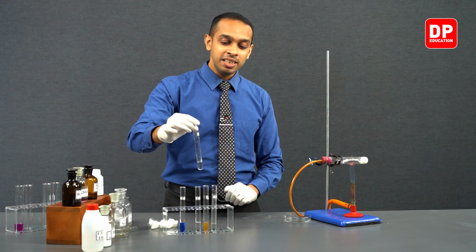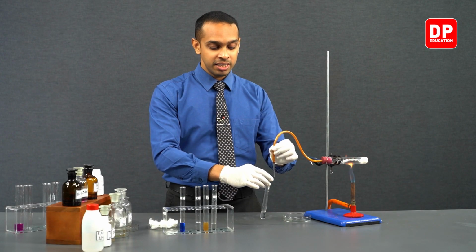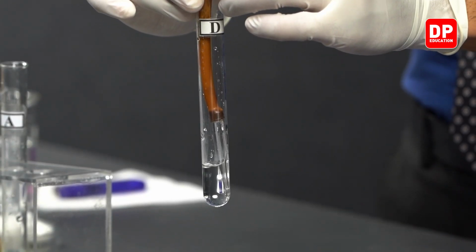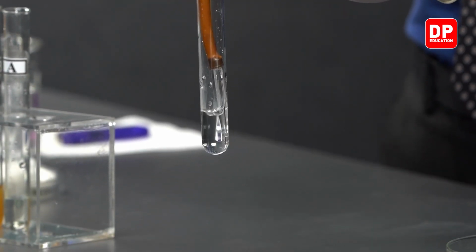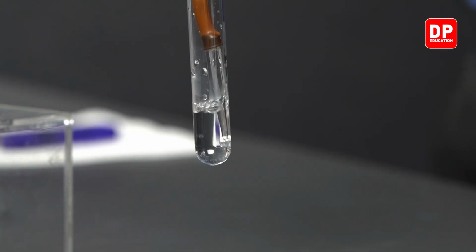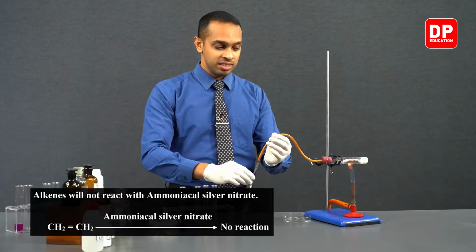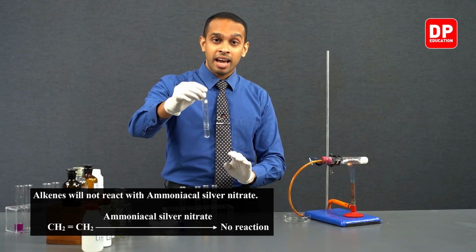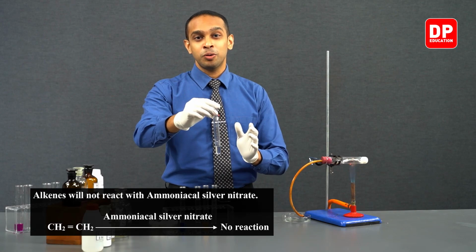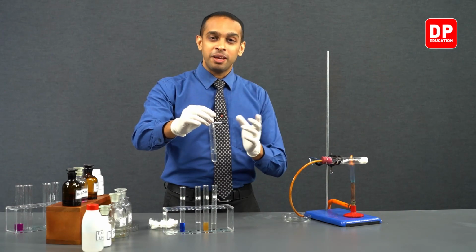In test tube D, we have ammoniacal silver nitrate. Now we are going to react ammoniacal silver nitrate with the ethene gas that is produced here. We will not observe any reaction when we send ethene gas through ammoniacal silver nitrate. Ammoniacal silver nitrate, or silver plus ions, do not show a reaction with ethene gas.